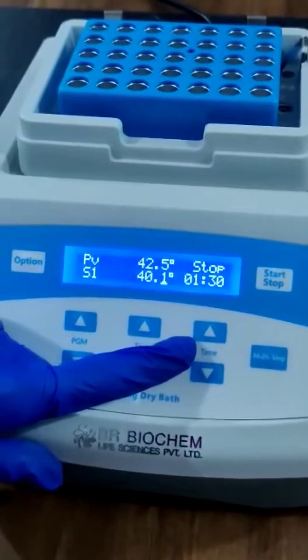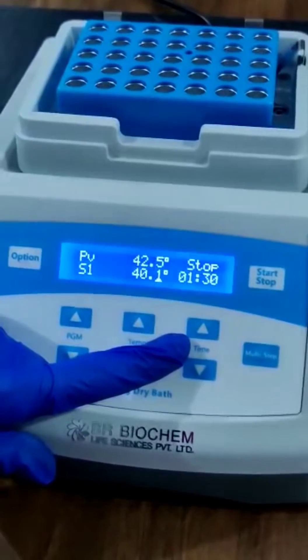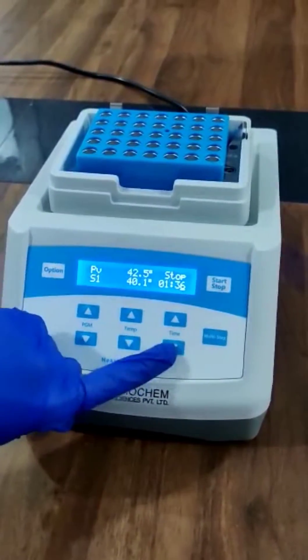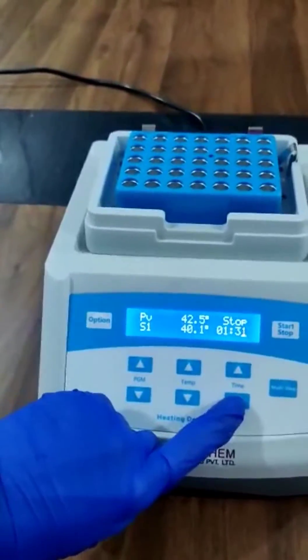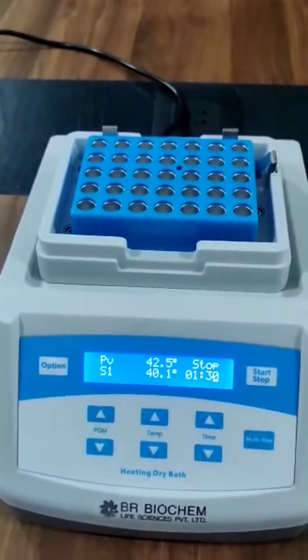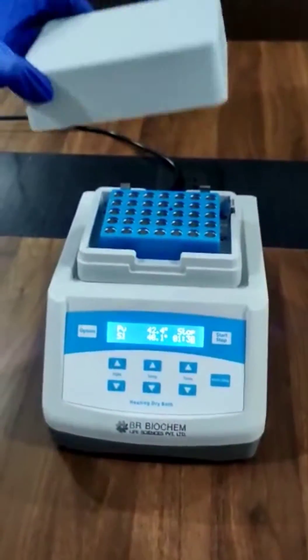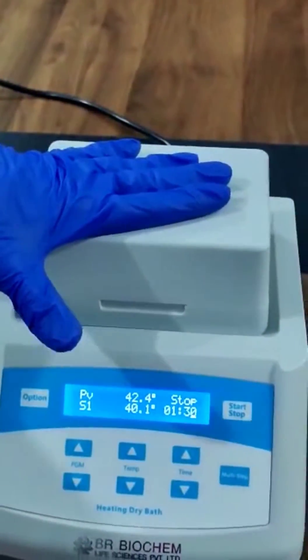From here you can set the time range. The time range of this incubator is from 1 minute to 99 hours. From here you can increase the time range, and from here you can decrease the time range. This is the lid of the dry bath incubator.